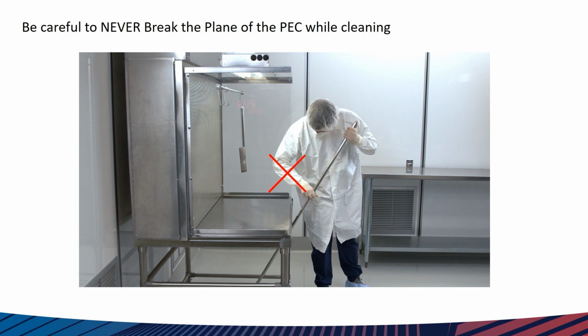So when you're instructing folks from E&F and EVS, they're used to being in the operating room. The analogy I always use is that's your anesthesia cart. You're never going to touch that PEC inside or out unless, and it is rare, the EVS staff is going to be trained to clean the PEC. And Abby and Kara yesterday did a great presentation on what that would entail if you were going to have EVS folks that were assigned to clean inside the PEC versus just cleaning the clean room itself.